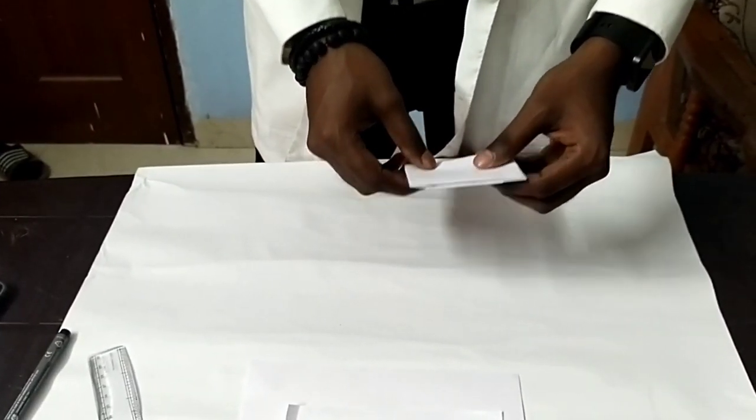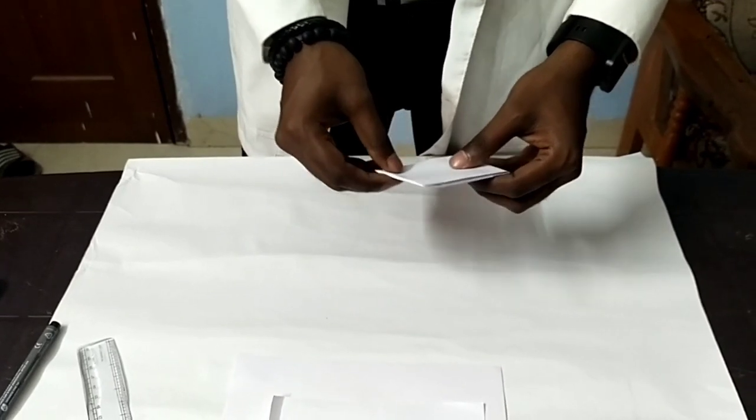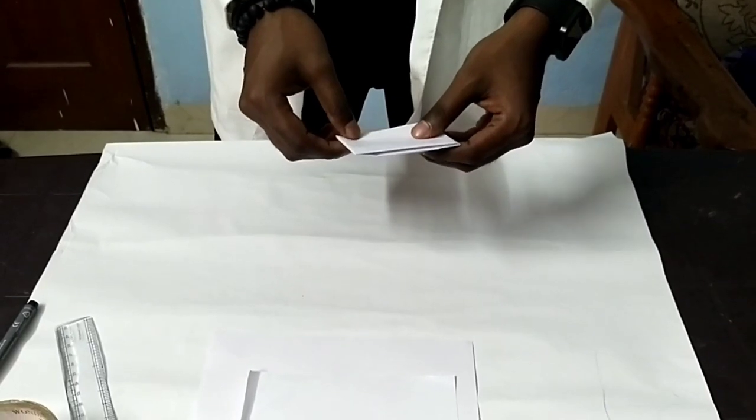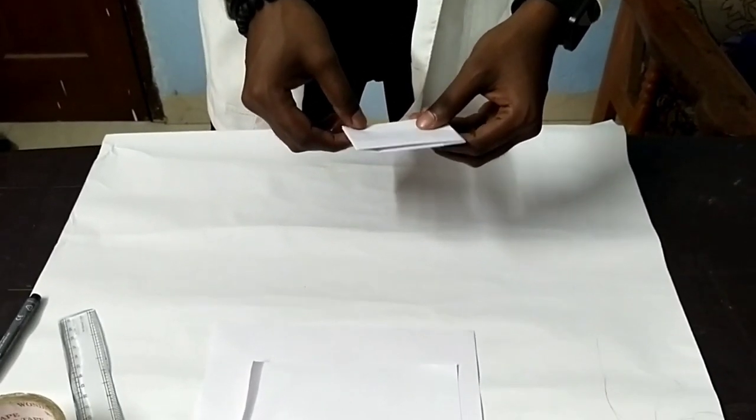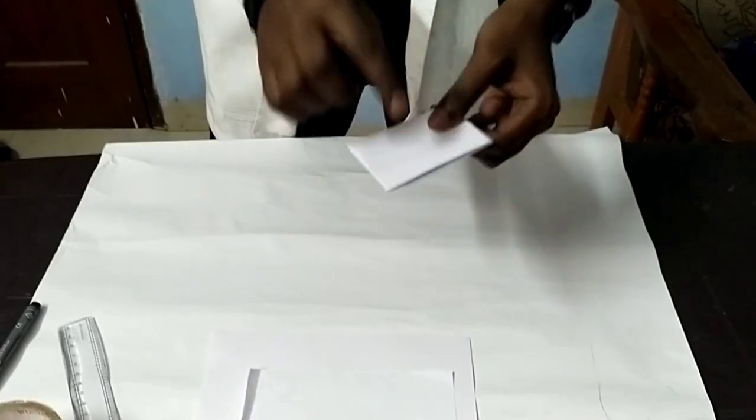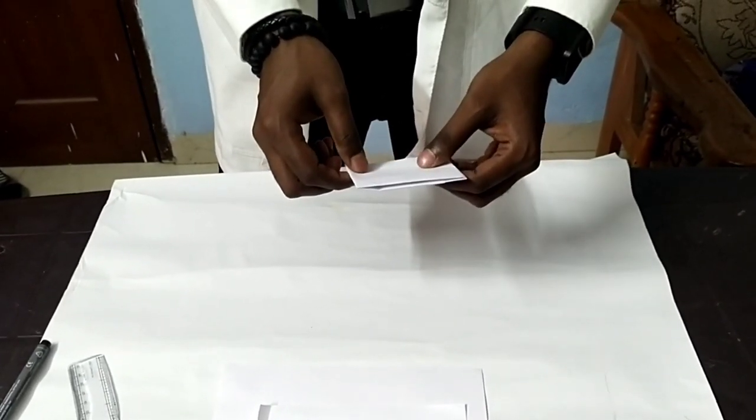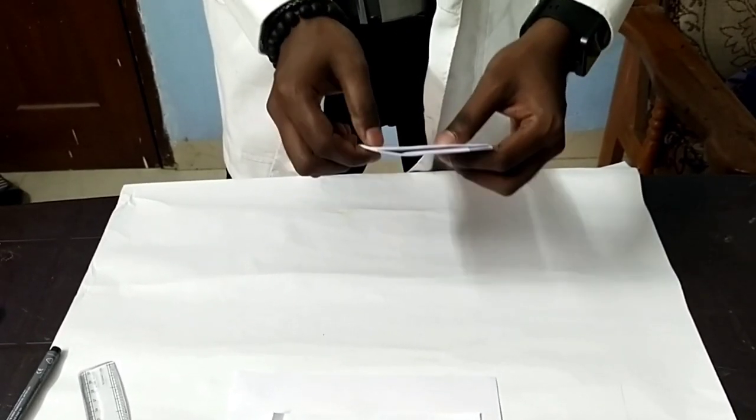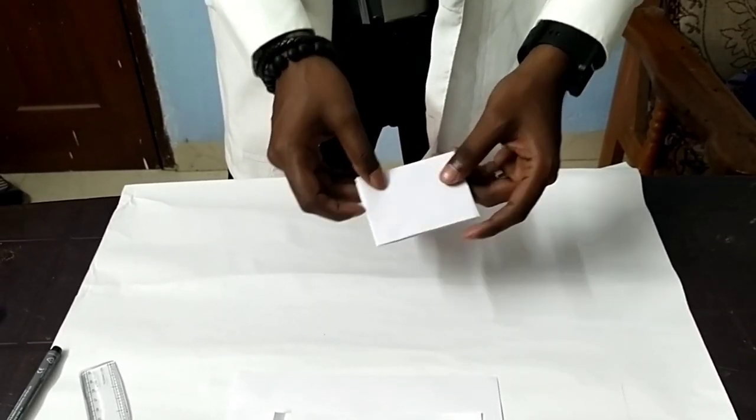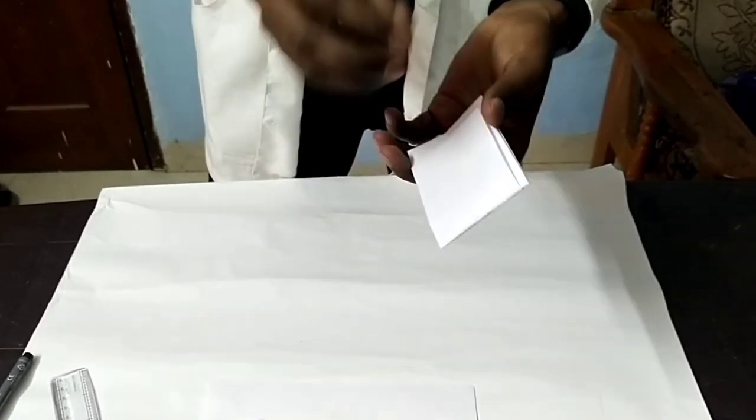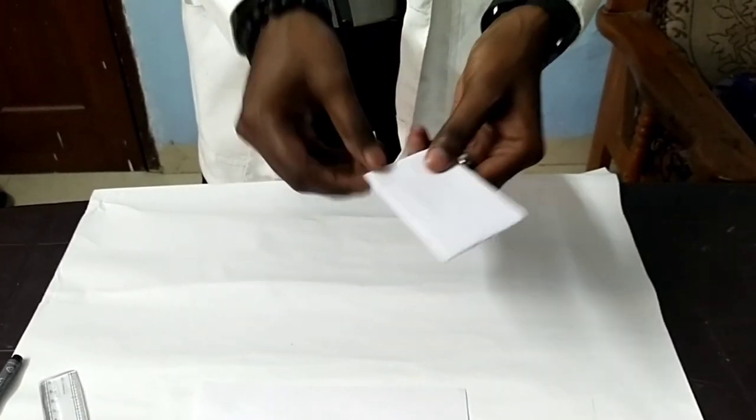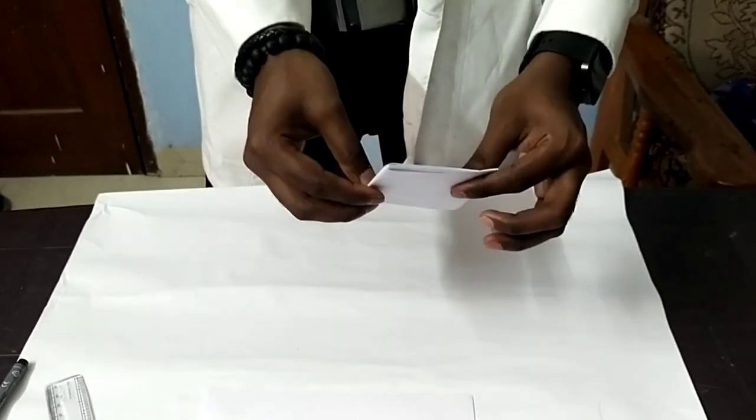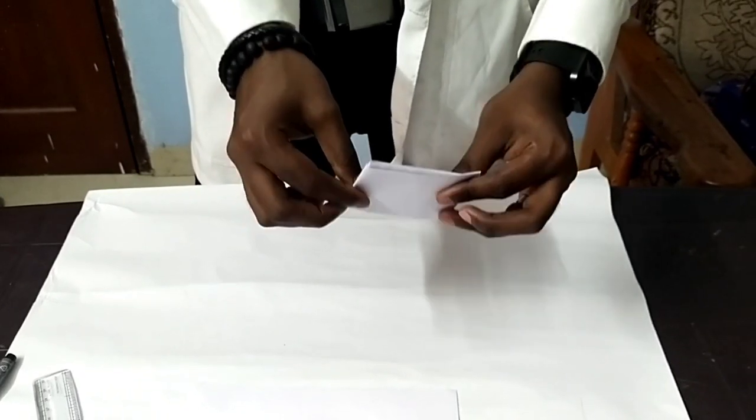Why is a druggist fold better than an envelope? The druggist fold is a better way to store trace evidence than an ordinary mailing envelope because it provides a secure and tamper-evident package. The folded edges of the paper create a barrier that keeps the evidence inside the package and makes it difficult to tamper without accidental opening. There will be no accidental opening occurring if we have completed the sealing with a thread.